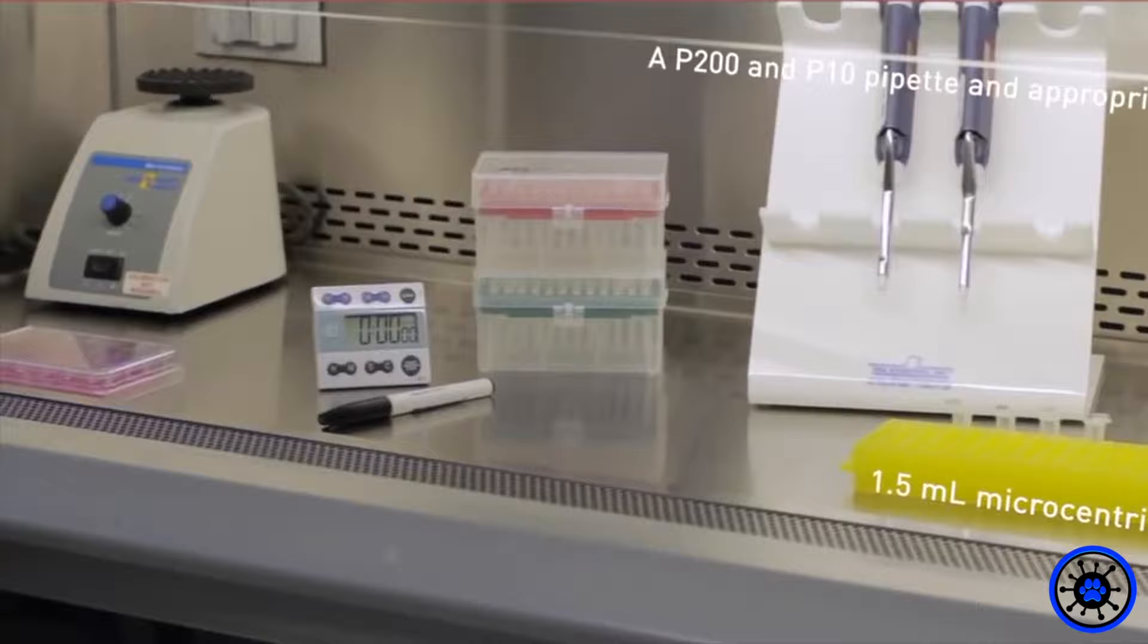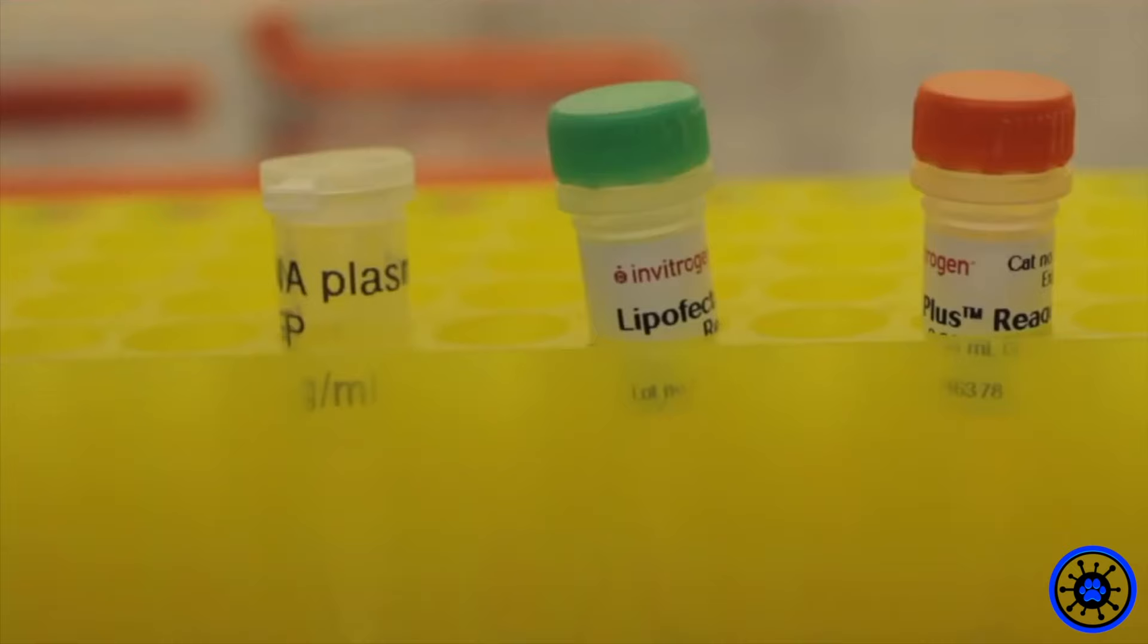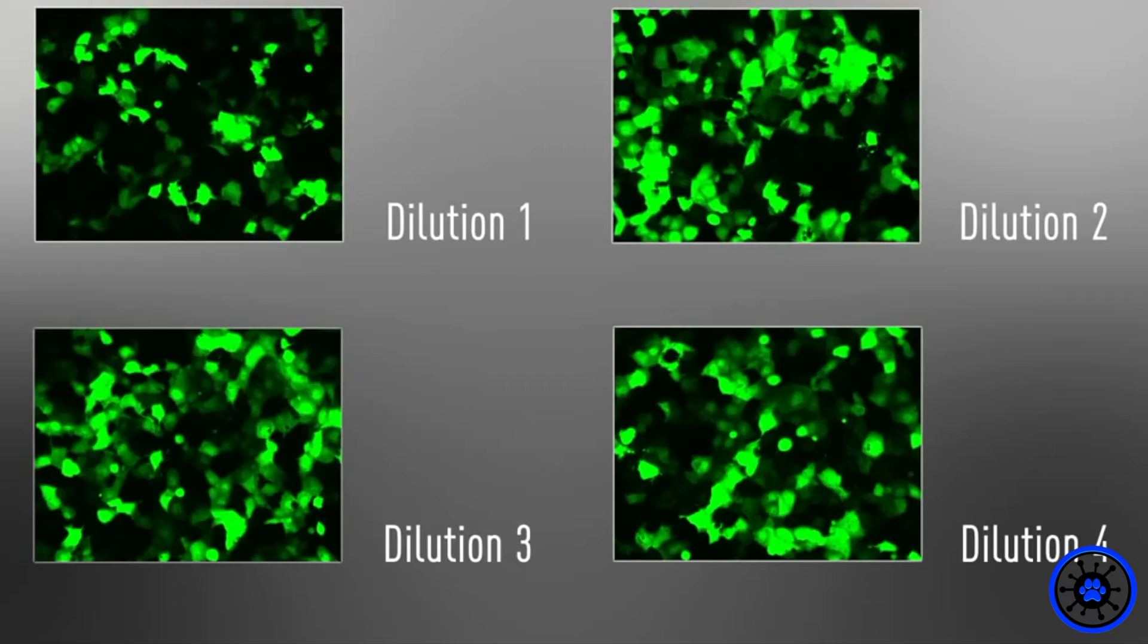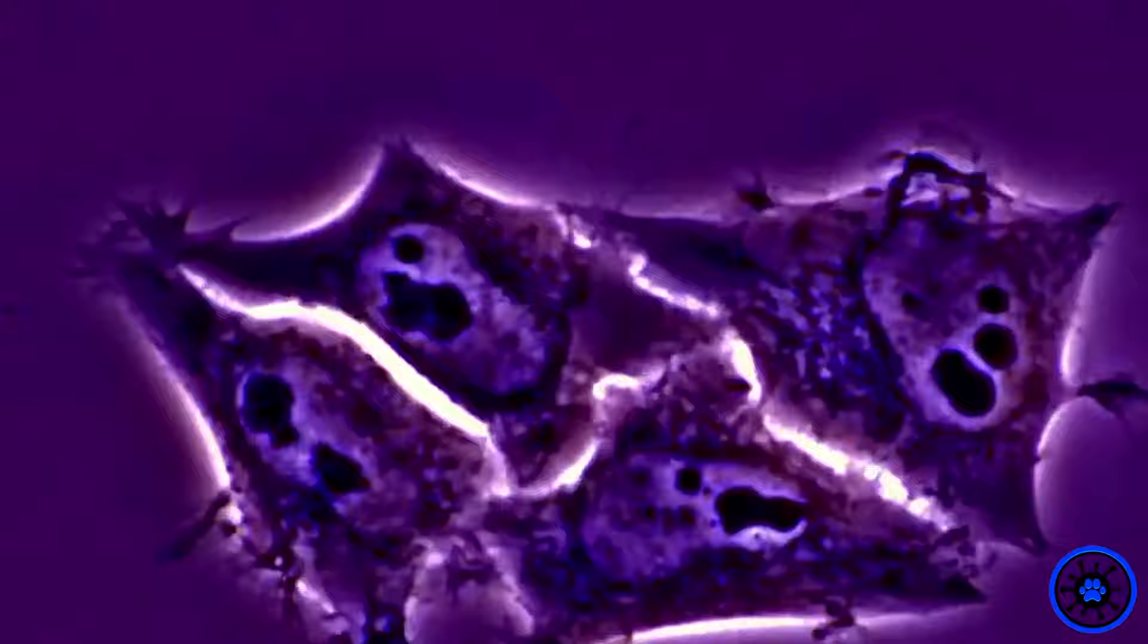This experiment was designed as an exercise in culturing and transfecting HELA cells with a plasmid and confirming insertion. The plasmid consists of green fluorescent protein and a selectable marker that confers resistance to an antibiotic. Only cells that have the plasmid inserted will survive the antibiotic treatment and express the green fluorescent protein.